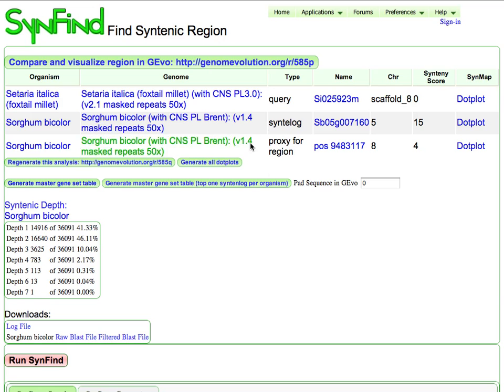So it says, oh, I found a region that's syntenic based on the overall synteny of all the genes within that region. And the score is lower. But I did identify it, so this most likely is due to a shared whole genome duplication event, which is in common with all the grasses.